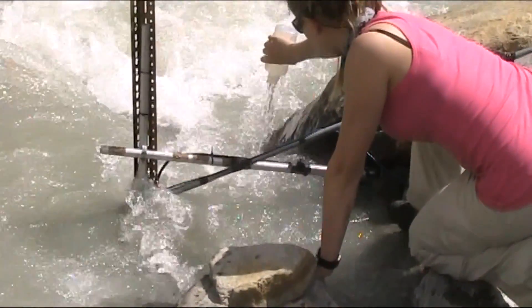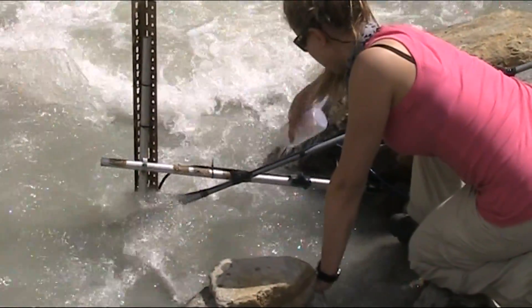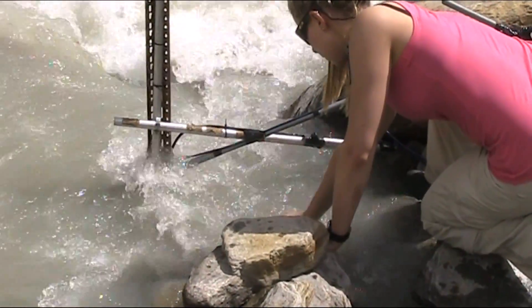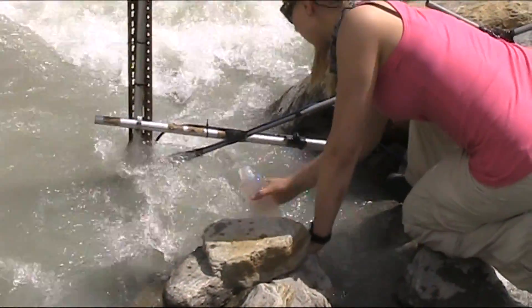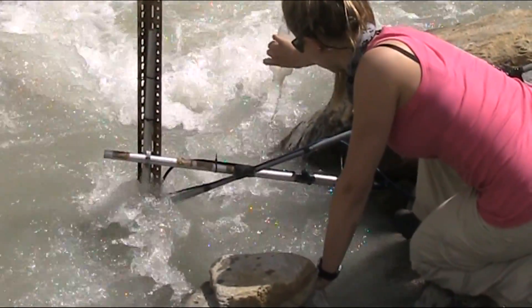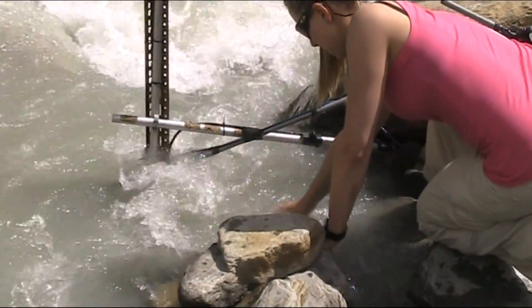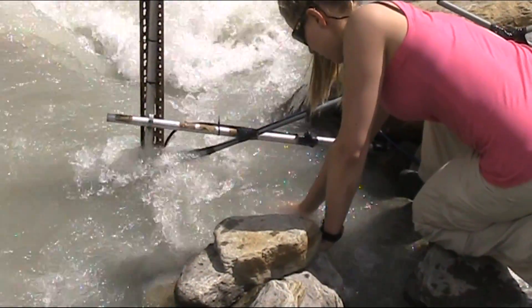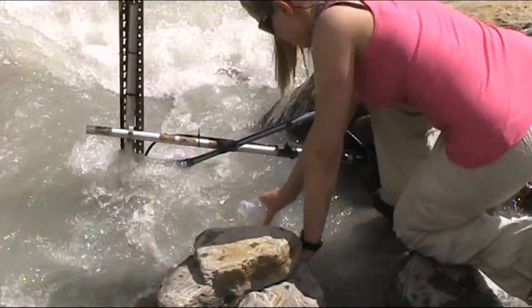The following clip shows Rachel carrying out her sample collection. As multiple samples will be taken at this site, it is essential to rinse the sample bottle several times to prevent any sediment contamination, and therefore to ensure accurate results. Harbin and Glasser recommend that you rinse the sample bottle at least twice before collecting each sample.